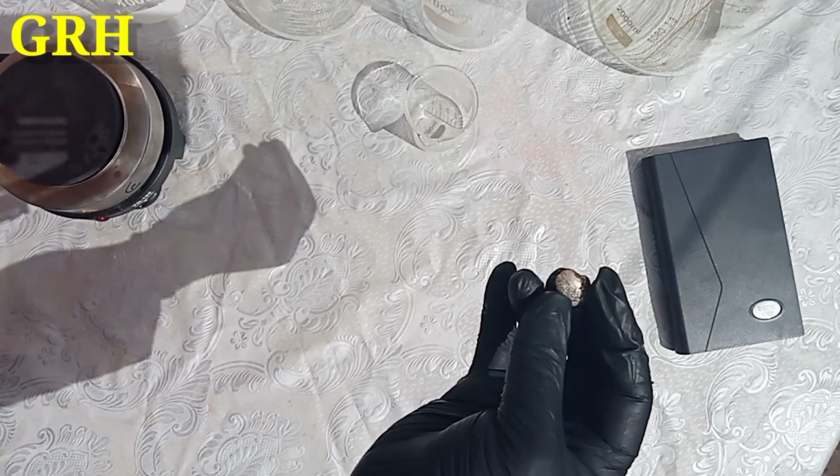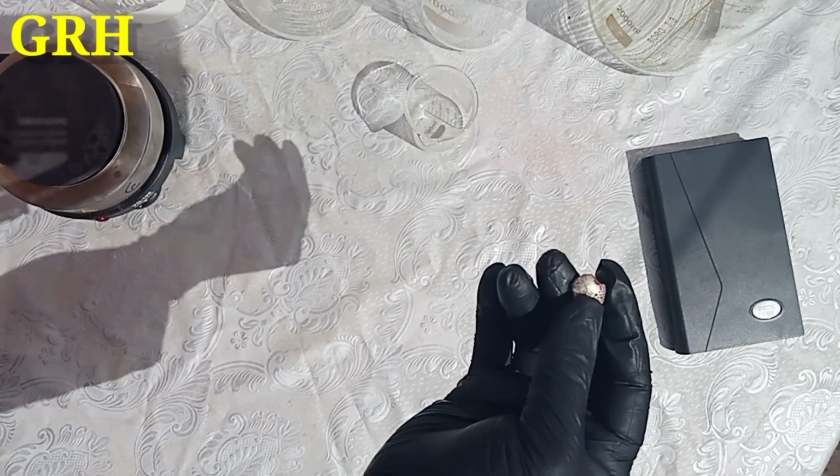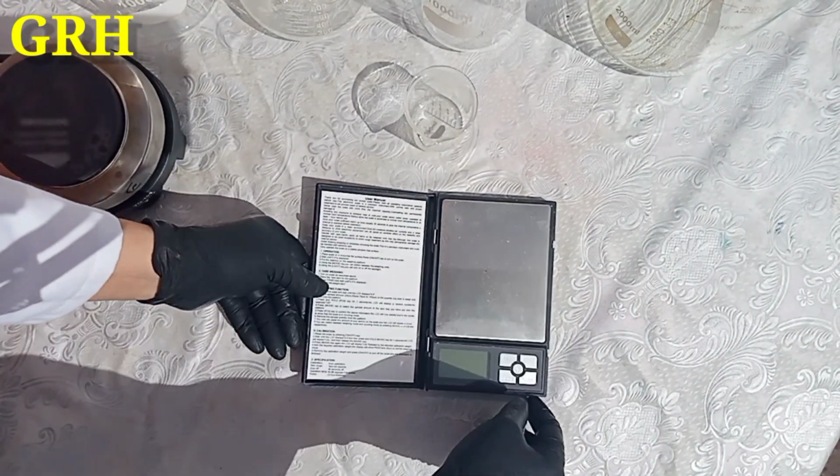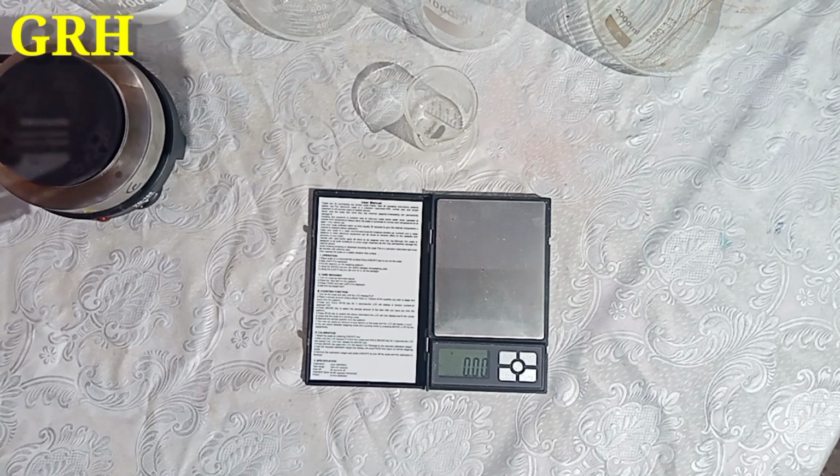The process shown in this video involves highly corrosive acids and should only be done outside or in a fume hood. Using safety gear such as gloves, goggles and a respirator is mandatory.